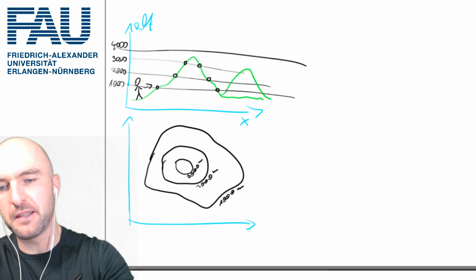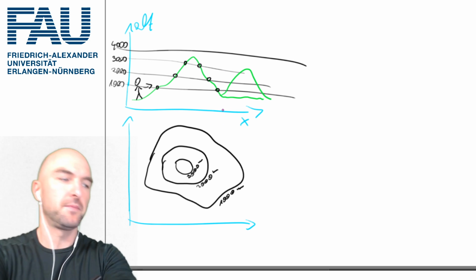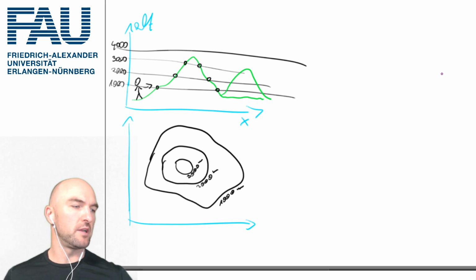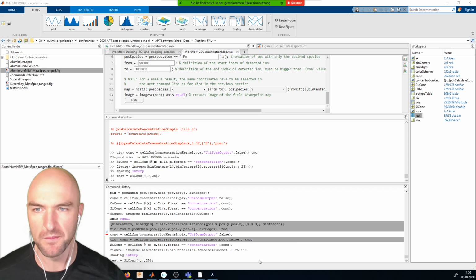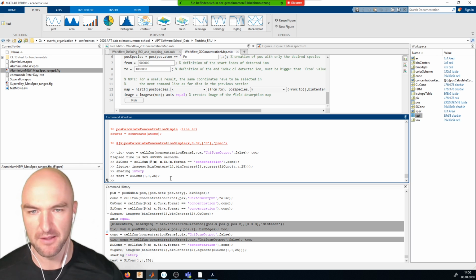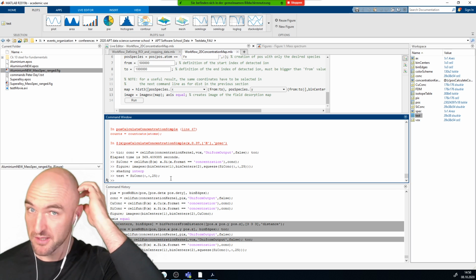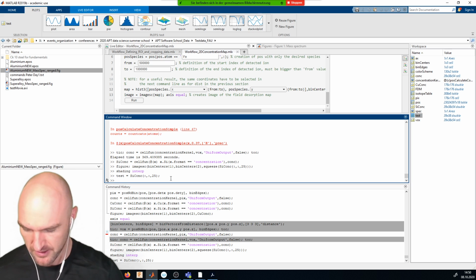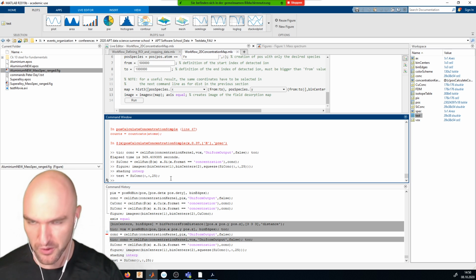And if we have multiple hills, we want to know where the valleys are, how deep the valleys are. And in order to do that well, the first thing I usually do is to look at what the statistical distribution of my, what the distribution of voxel values is, right? So the way I can do that is using so-called linear indexing.